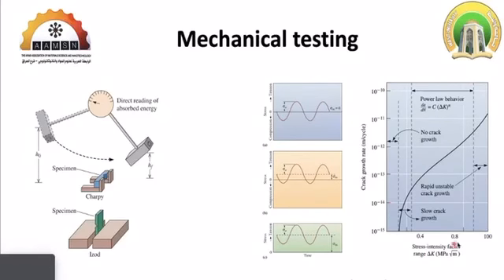And also we can construct this graph to follow the fracture during the fatigue test.